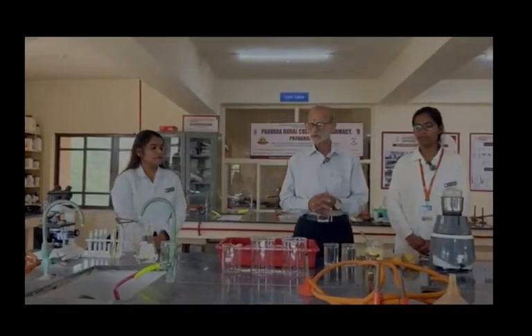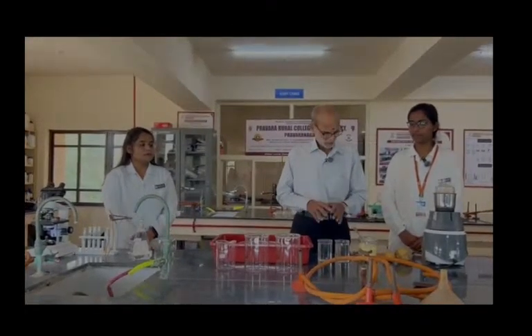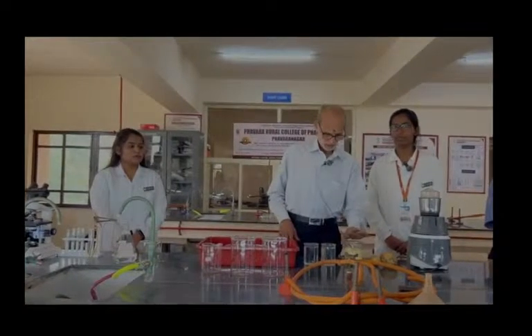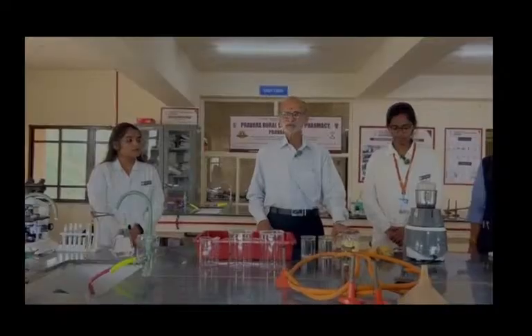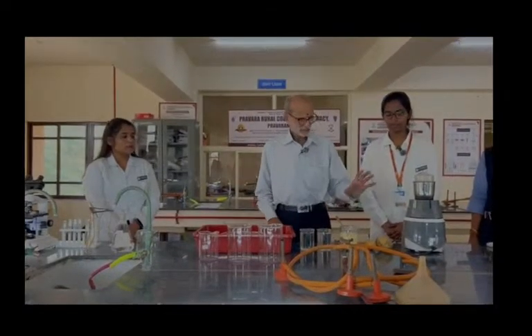We are going to demonstrate to you the starch separation from potato. And here we have a potato, and these are the peeled potato pieces. What we are going to do is make a pulp in a mixer. Bhakti is going to do that, and thereafter we will be passing it.